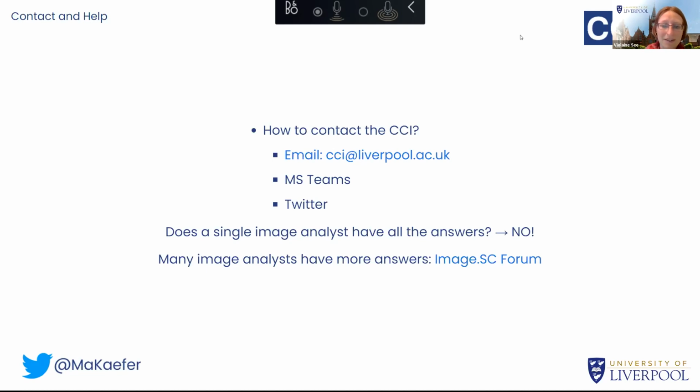Maybe Grant and Christoph can help about imaging through homemade PDMS dishes. I don't know if you have any view on that from York, if you have tried that. Yeah, it just depends on the design. Basically the most critical thing is imaging through appropriate optical glass. So ideally high precision, 0.17 millimeter optical thickness glass. You can get away with the standard, but that's your key thing.